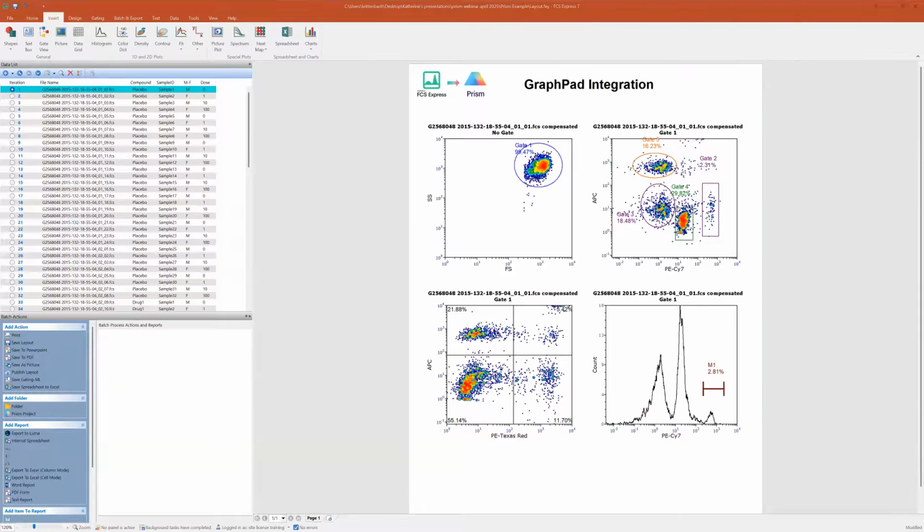Once it's saved, as soon as you load in the data file onto an object in FCS Express, those extra keywords are going to automatically be pulled along with the data file into FCS Express. If you've already loaded that particular data file into the data list and into your layout, but you did that before you created your extra keywords file, you might just need to reload your data files.